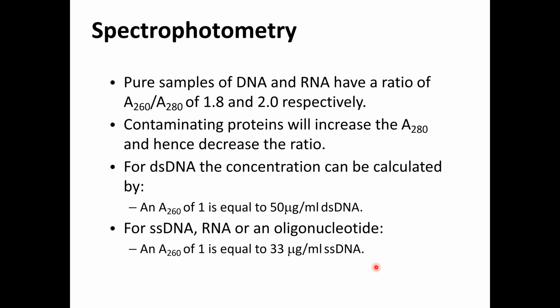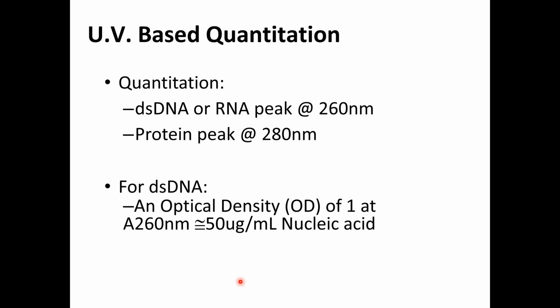Again, do not interchange these figures between double-stranded DNA and single-stranded DNA, RNA, or oligonucleotides.